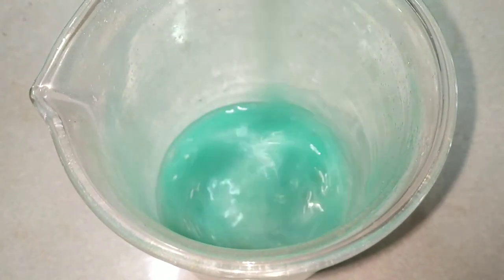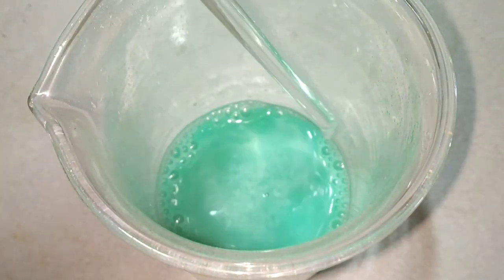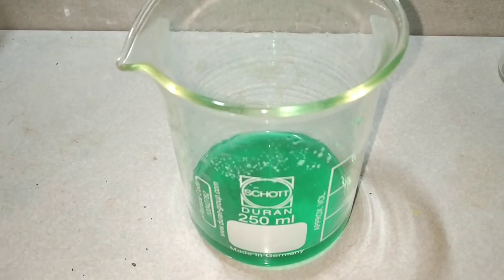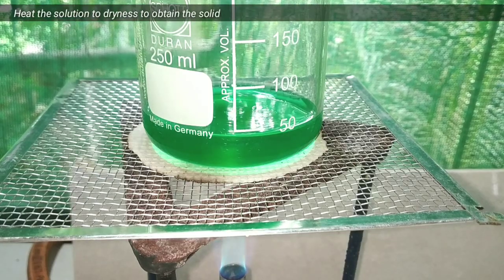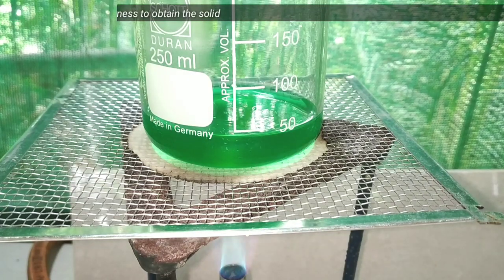We mix it up well with the help of a glass stirring rod in order to complete the reaction. After everything has reacted, we are left with this green colored solution, which is the copper 2 chloride in solution. Now we heat the solution to dryness to obtain the solid copper 2 chloride.